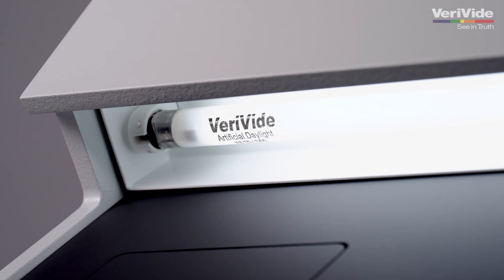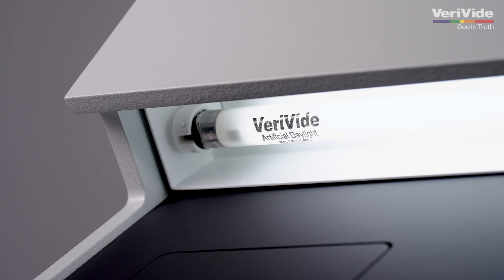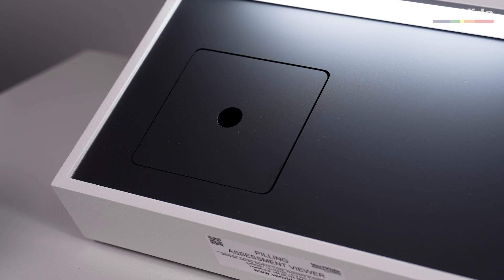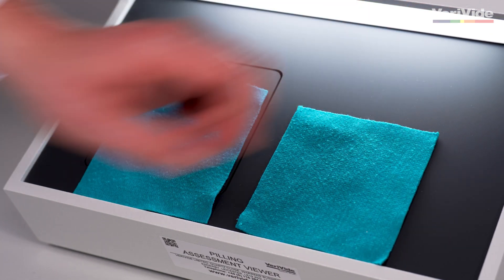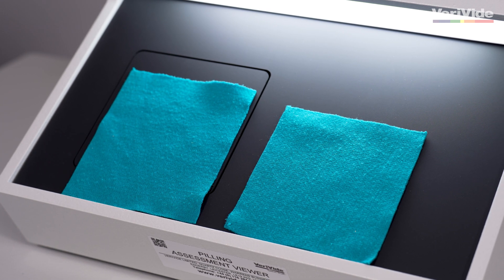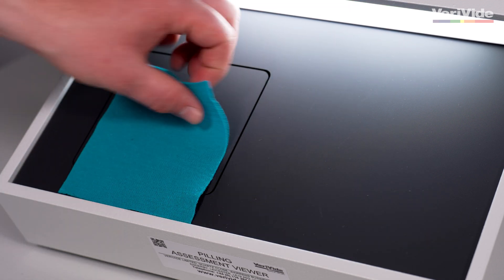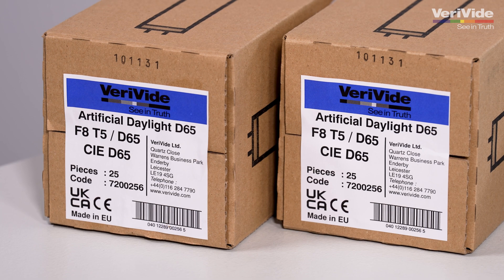In 2020, the ISO made changes to the light source standards, specifying that the PAV unit must be illuminated using artificial daylight D65 lamps, in accordance with ISO 3668. This specifies that a CIE D65 light source must be used and have a brightness of at least 600 lux to give uniform illumination over the surface of the viewing apparatus. To meet these requirements, Verivide developed its own true CIE rated D65 lamp.